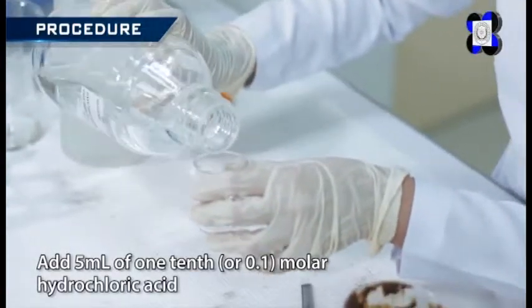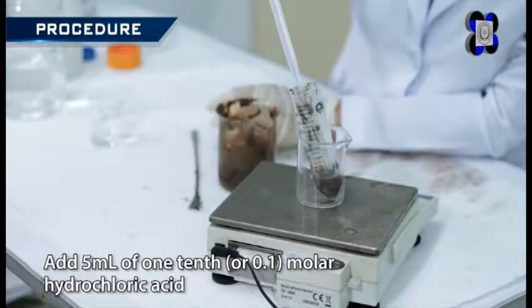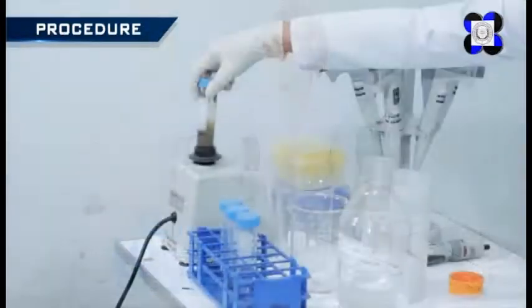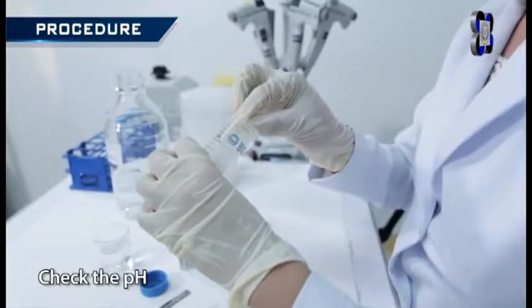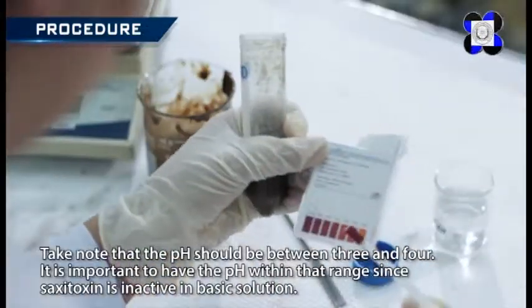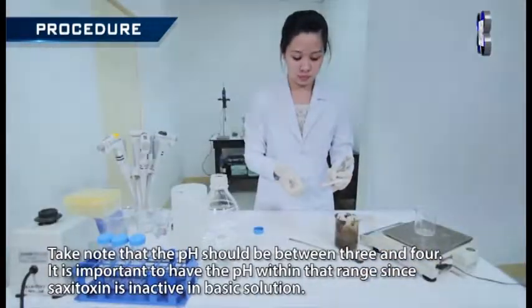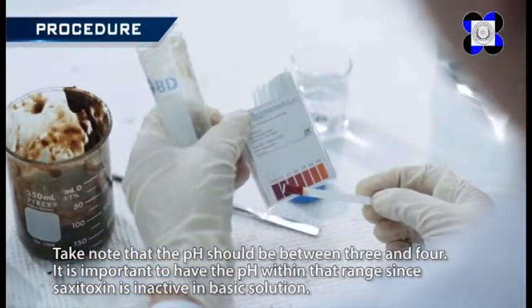Add 5 milliliters of 0.1 molar hydrochloric acid into the homogenate and stir thoroughly, using a vortex mixer when necessary. Then check the pH. Take note that the pH should be between 3 and 4. It is important to have the pH within that range since saxitoxin is inactive in basic solution.